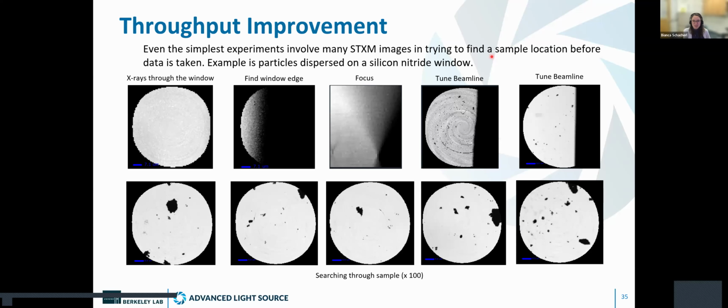So you mean it's more about the scanning, not about the zone plate, like about the spiral scan? That's the hindrance, not the zone plate. It's the limits of our motor. It's only 80 by 80 microns for the fine motor, the zone plate motor, and then the coarse motor, or the sample motor, is just not designed to be able to do this scanning. It's way too slow. Okay, thanks.